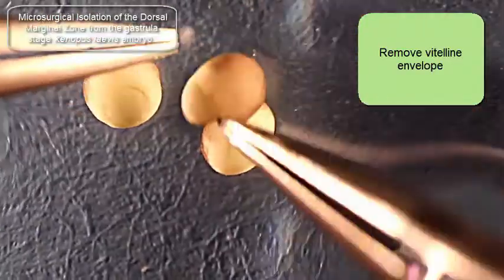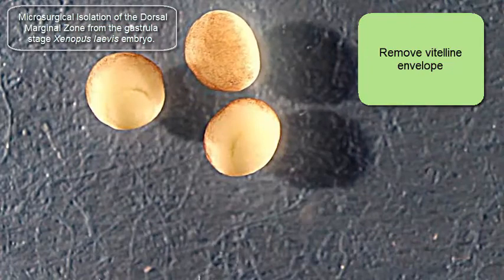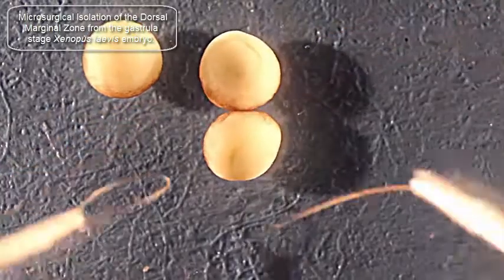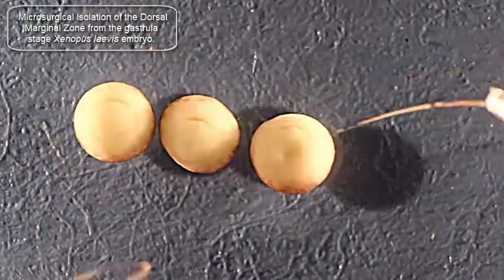And inspect the embryos for which ones I want to actually dissect. I'll take a look at them, roll them over, line them up, make sure that they're all the same stage, and then I like the middle one best.